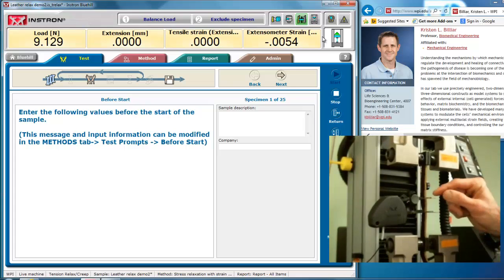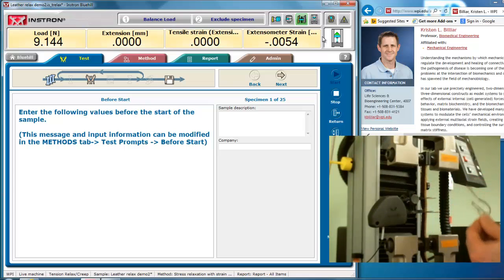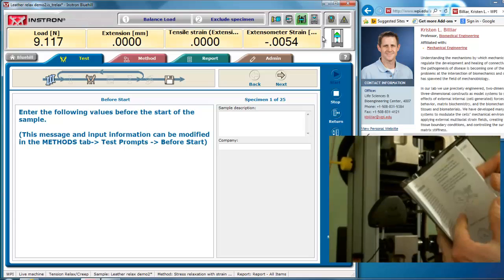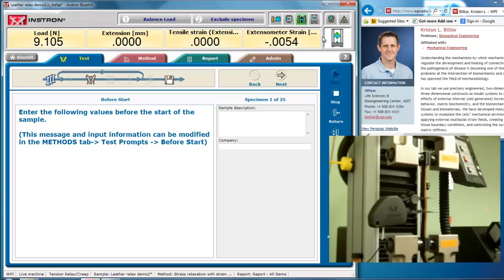The tension on the extensometer can be changed by using different wire clips. If I have a thick sample, I can use thick grips here, the wire clips. If I have a circular sample, there are different wire clips. These are for a circular sample. They look very similar, and I can show you in the manual. Clips for round specimens have an extra little piece there, and clips for rectangular specimens look a little bit different. I've put in the clips for the rectangular specimen in here for a thin sample. My sample is about 1.5 millimeters thick, so I put in the smallest grips.